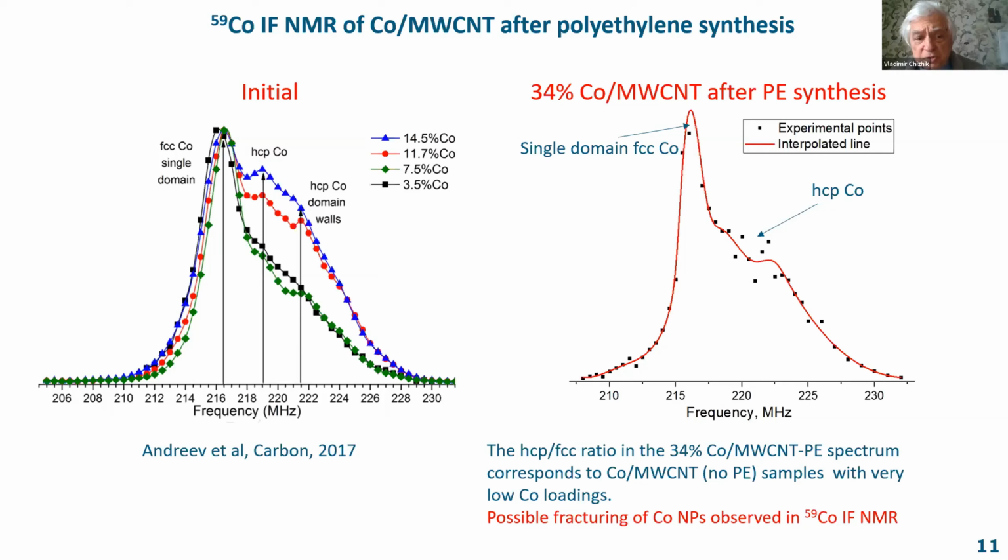But which method was used for obtaining each point? Free induction decay, or spin echo, or other? It was a pretty usual technique. It's a step-by-step spin echo experiment with the change of carrier frequency to obtain the intensity, then the echo signal was Fourier transformed.